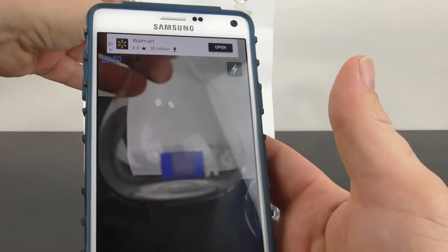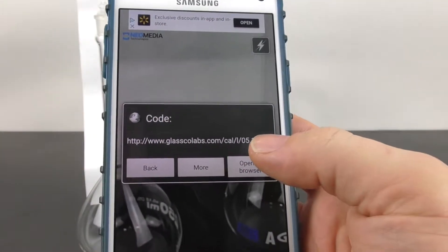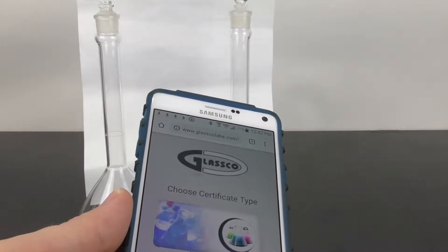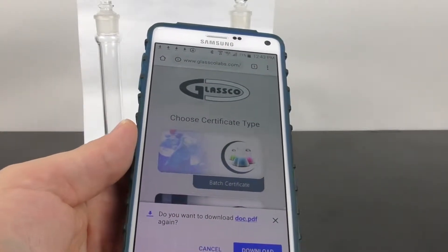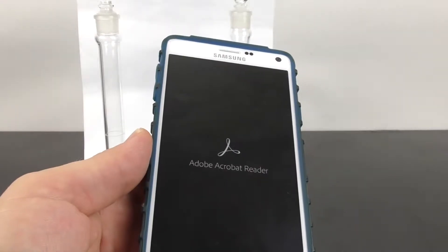Just focus it in and it will register. Open in browser, click the certification, and on an Android phone you have to do this one extra step for downloads.